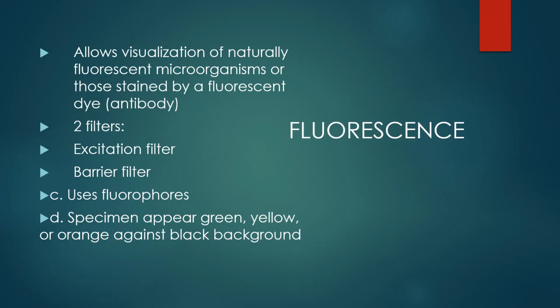And yes, for your fluorescence, it will allow visualization of naturally fluorescent microorganisms or those stained by fluorescent dyes. You have two filters actually used for this one: your excitation and your barrier filter.